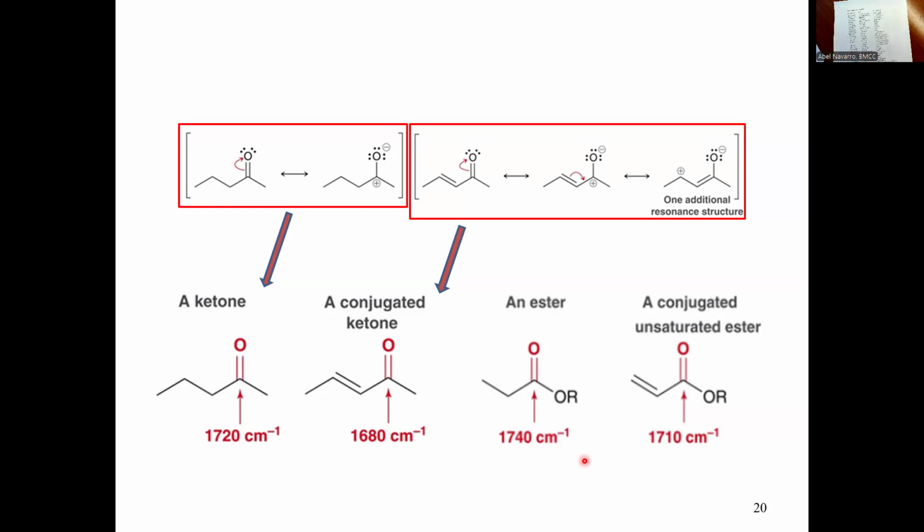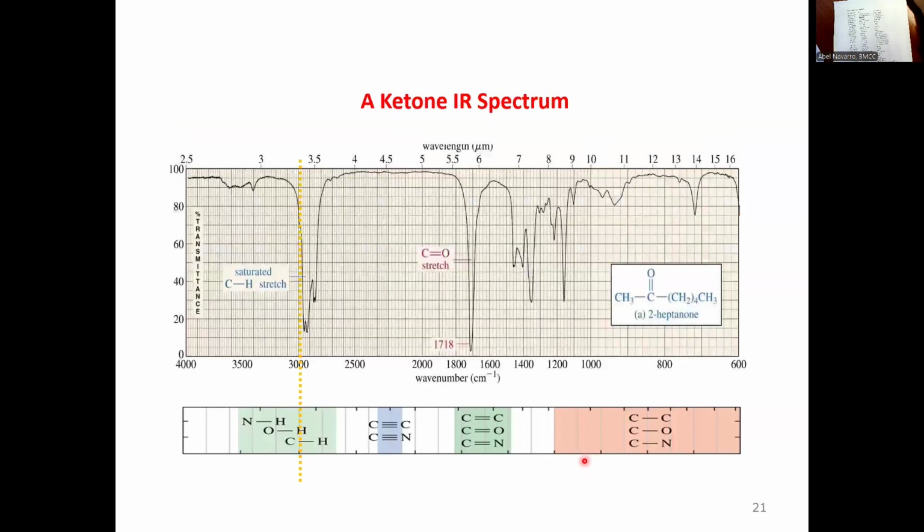The differences I was telling you apply to carboxyl, amides, and aldehydes. Those are the ones that you can distinguish with infrared. In the case of ketones, that's the baseline, and esters are really, really similar, so they're kind of difficult to differentiate from each other. So for those two, I would recommend you to use what? To use NMR, which is our next one. Okay, so this one is a ketone, CH sp3, right?